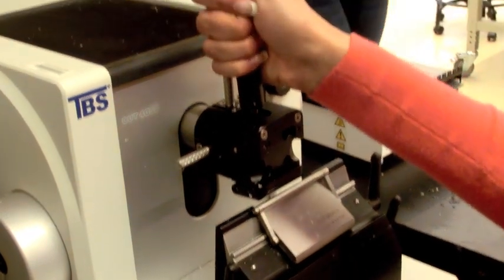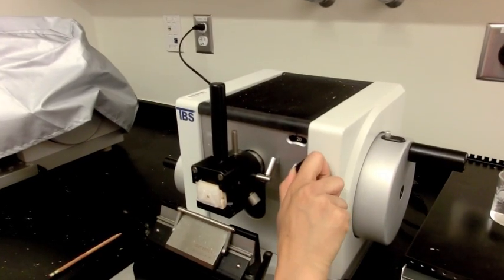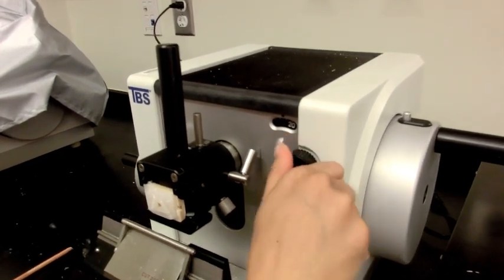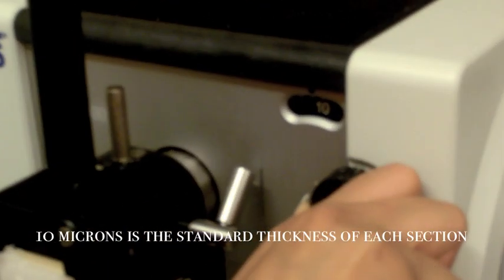When you are ready to section the paraffin embedded organ, place the paraffin cartridge in the microtome while pulling the main handle toward you. Use the knob on the right to adjust the section thickness required for your sectioning, approximately 10 microns.